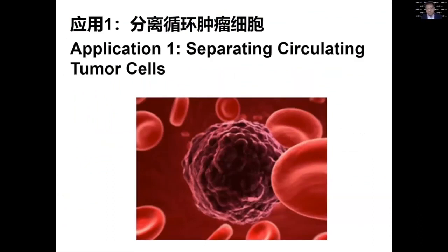So far I have given a very brief introduction of the mechanism. I went very little into the mechanism. I showed a few capabilities of what acoustic tweezers can do. Now I'm going to mainly go to different applications, and how acoustic tweezers can impact biology and medicine.